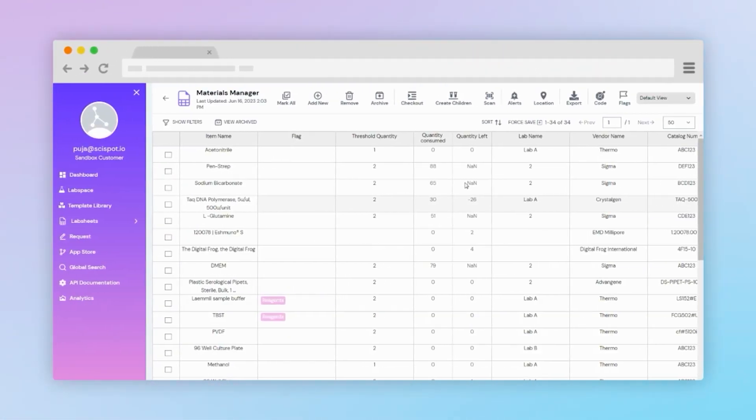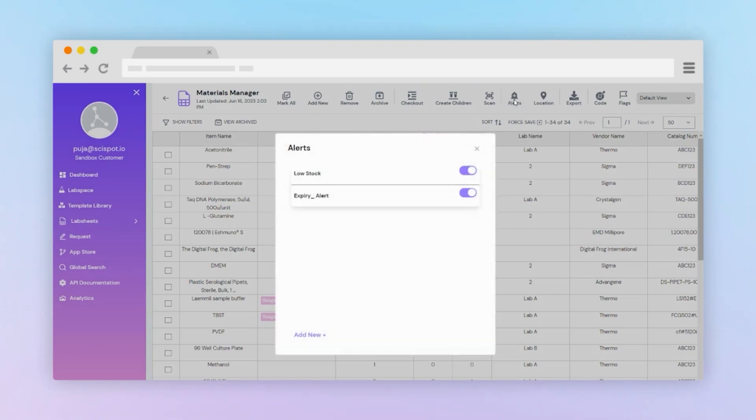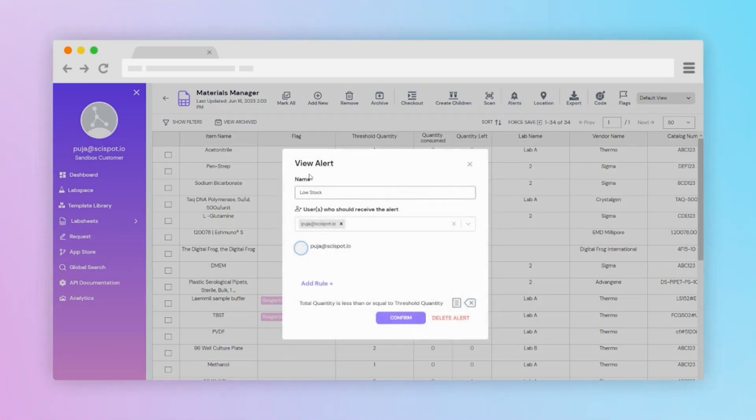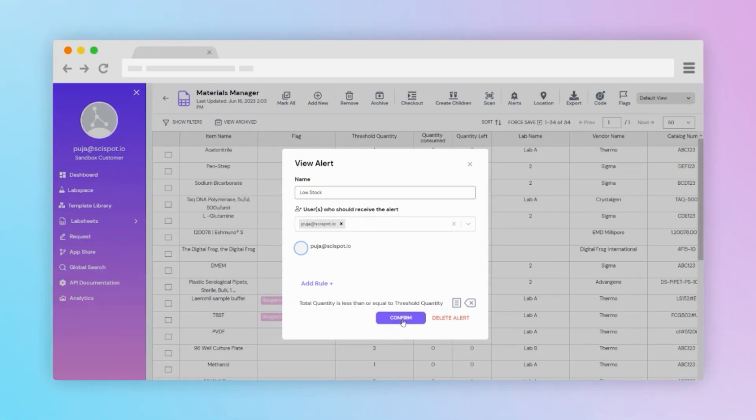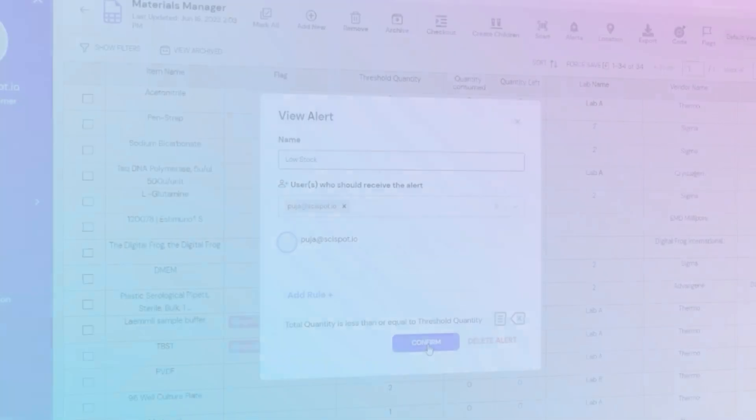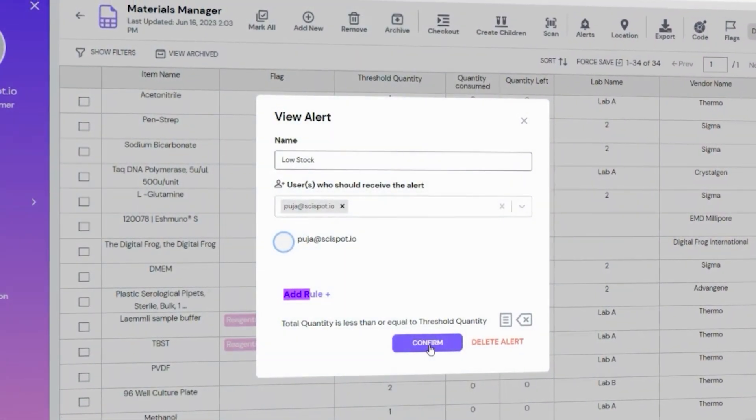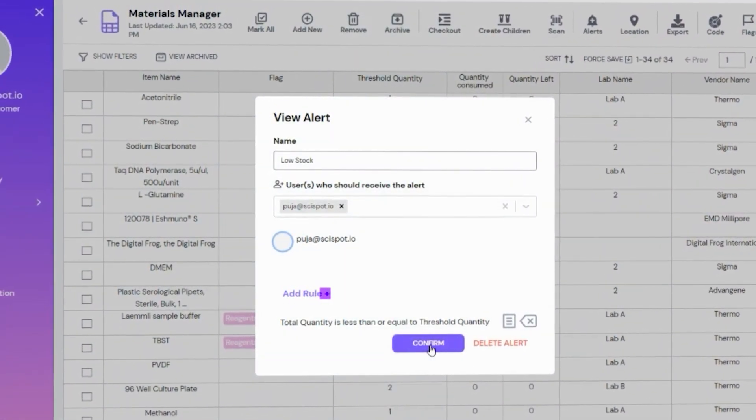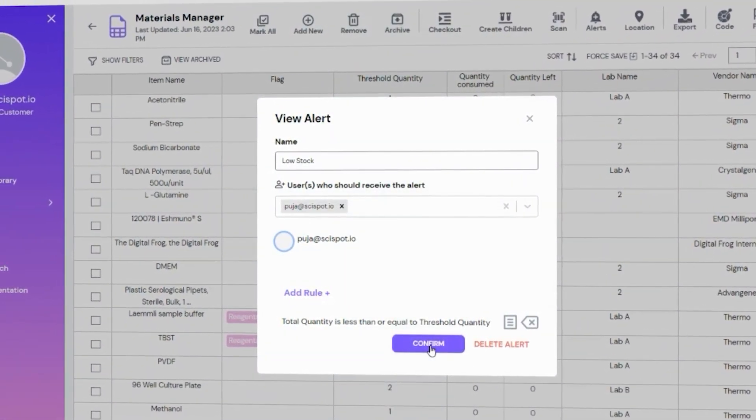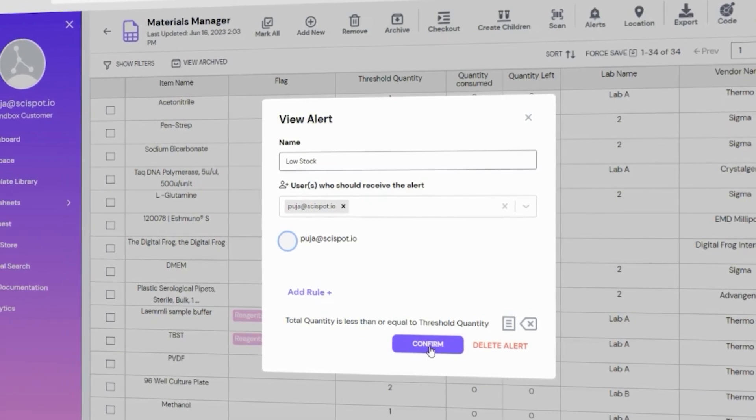In addition to data analysis, LabSheets can be utilized for inventory management. For example, the Material Manager allows for automation by integrating with Quartsy. Users can set up alerts for low stock levels, triggering notifications to specific team members. Customizable rules can be created based on individual requirements.